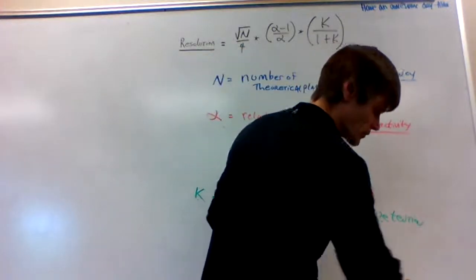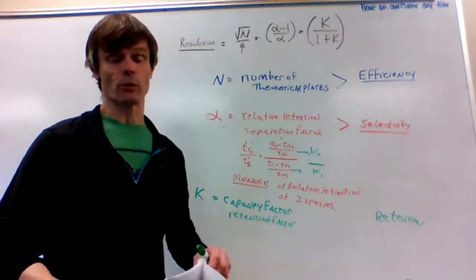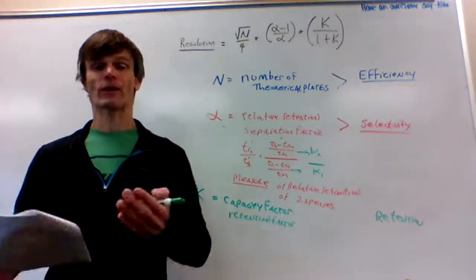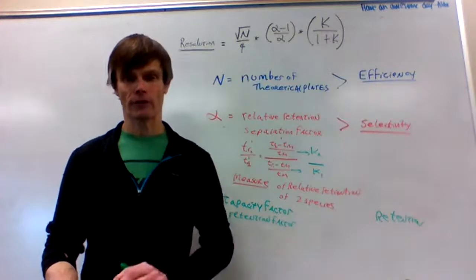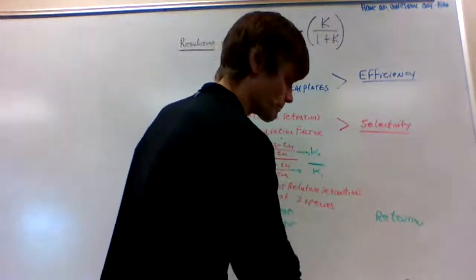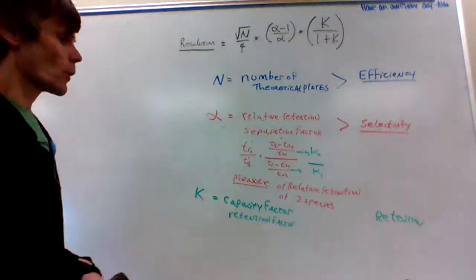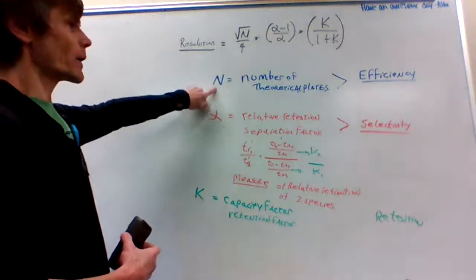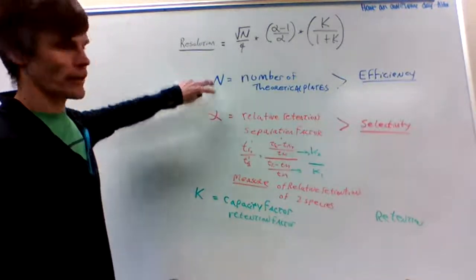And when we make these changes, what's really important is the experimental conditions in which we're conducting, whether we are conducting an experiment using liquid chromatography or gas chromatography. These are going to be 2 factors, two comparisons that we'll be discussing in the last section. But we're going to look at each of these individually. And we're actually going to start backwards. We're going to look at retention first. We're going to look at retention, selectivity, and then we're going to end on efficiency, because we're going to introduce the Van Deemter equation to help us understand a little bit about that.